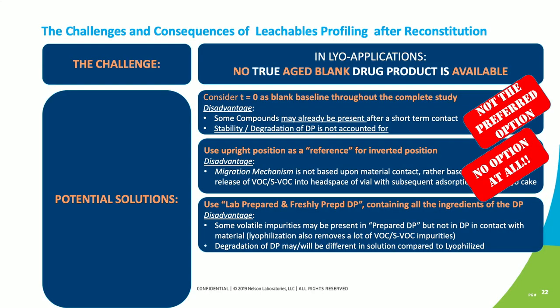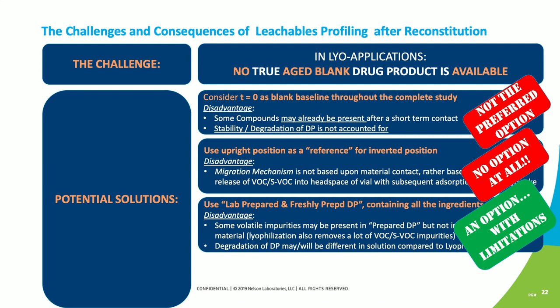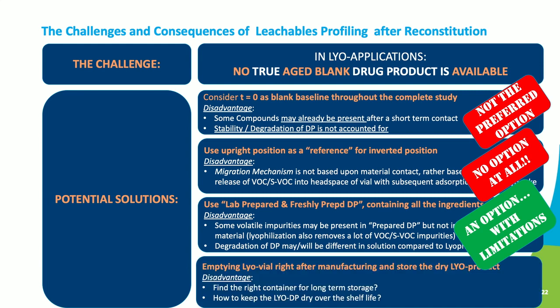The third option is to use lab-prepared or freshly prepared drug product that contains all the ingredients. But again, it comes with disadvantages, and one of them is that the drug product degradation will be different in the solution when compared to the lyophilized drug product, which is solid. So we can use this option with some limitations.